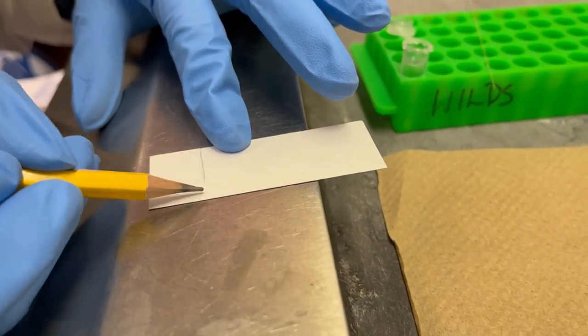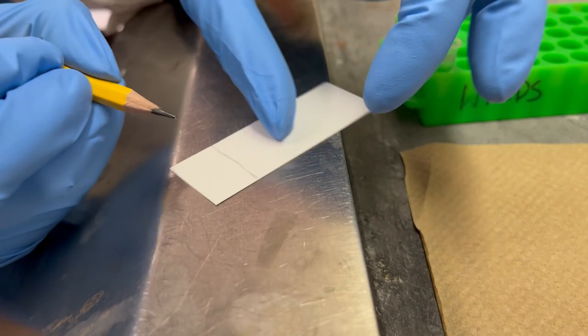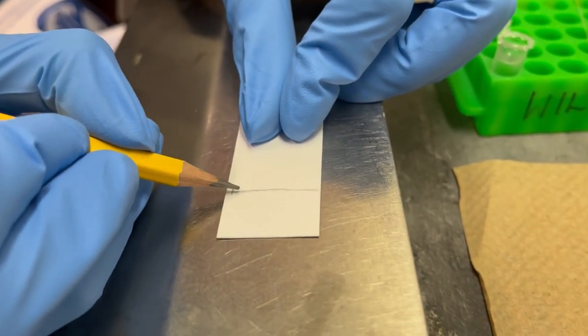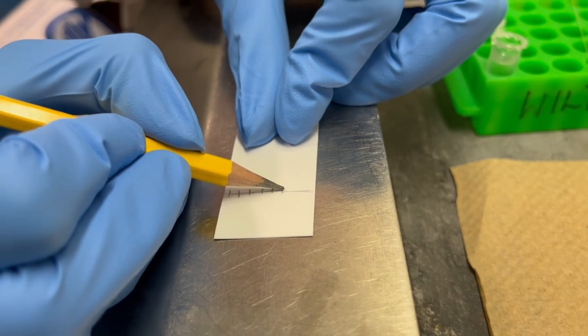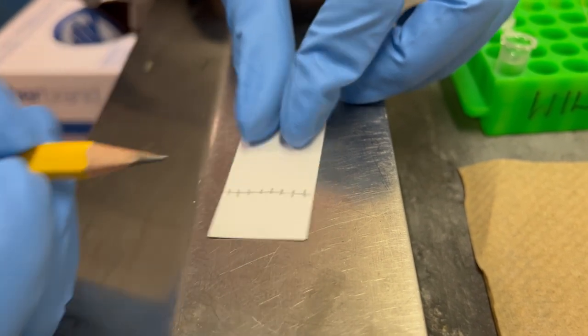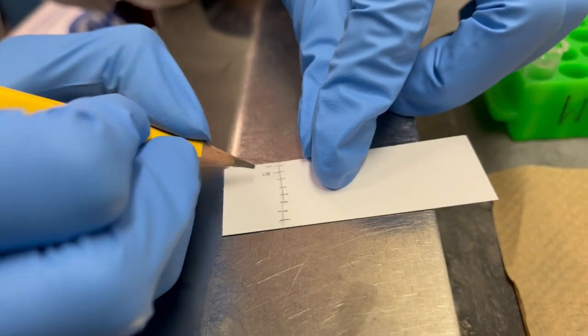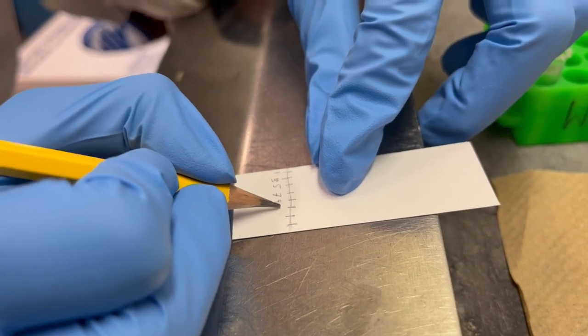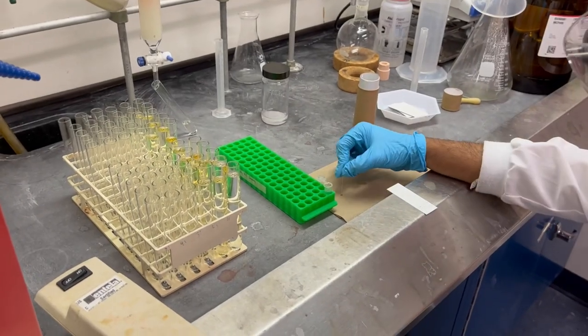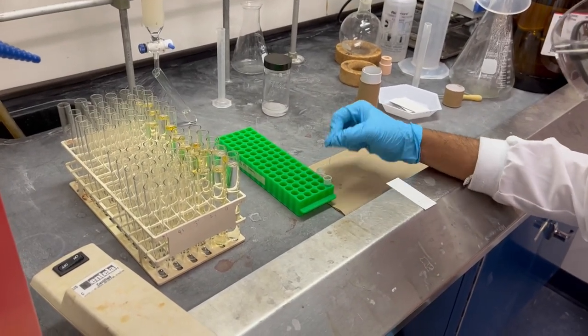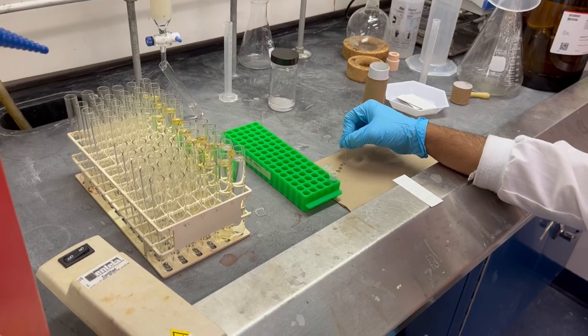Once a UV active spot is observed, silica plates are prepared with the fraction numbers using a pencil. For this column, every second fraction from the first active one were chosen. Fractions are then spotted on the line of the plate. The impure, crude mixture is also spotted along them as a reference point. The same glass spotter is reused but cleaned between each spotting with a solvent like dichloromethane.